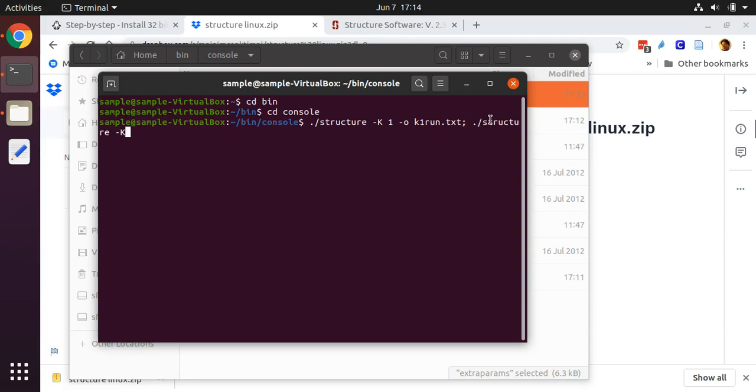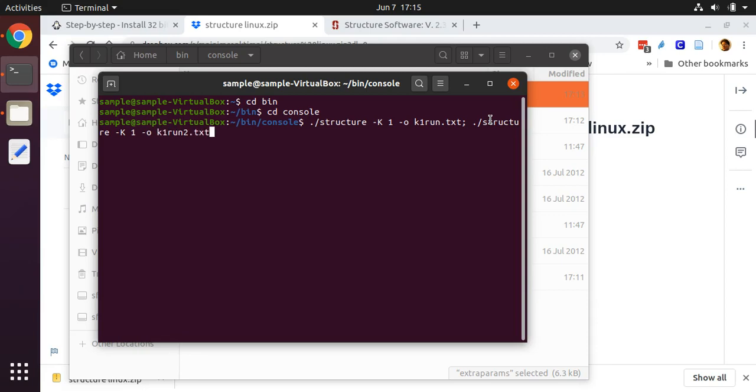I'm going to put in the STRUCTURE command again. This time, I'm going to do it for k equals one again. This is because it is recommended that you have multiple replicates of your STRUCTURE runs for each number of inferred ancestral groups. This one I will call k1_run2.txt.